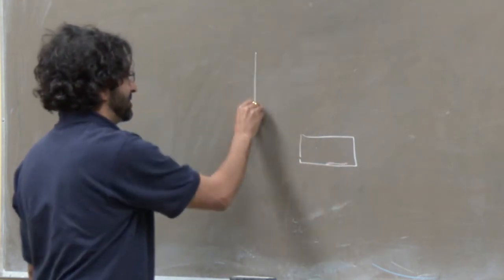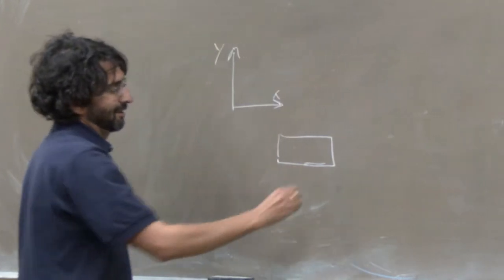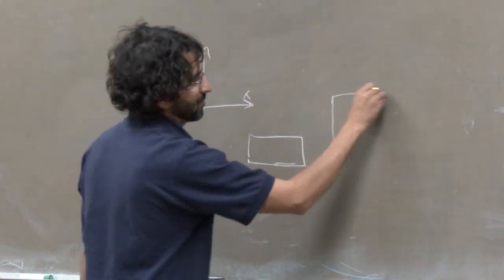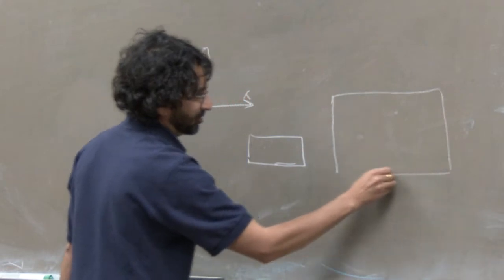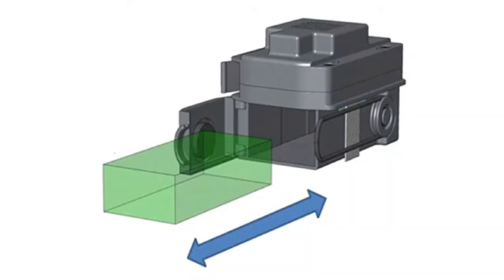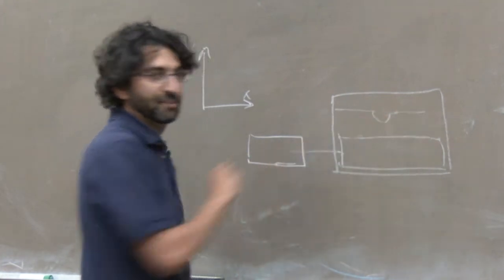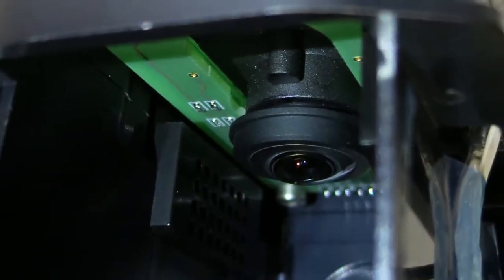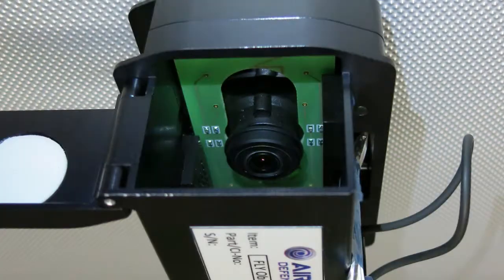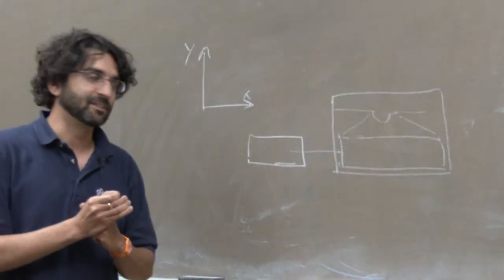And like any engineering drawing, I need my axes. Excellent. And then we were constrained by the shape of the observation system, such that this can go inside, within which the house of the flies is inserted. Inside it, we're going to have our camera up there with a fisheye lens, such that the fisheye lens can capture the entire resolution, the entire space of where the flies are living.